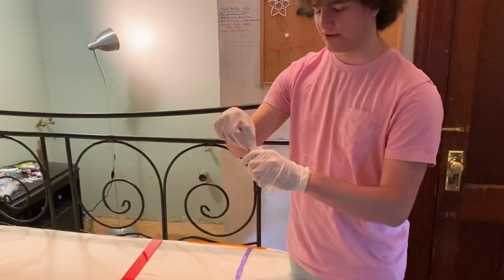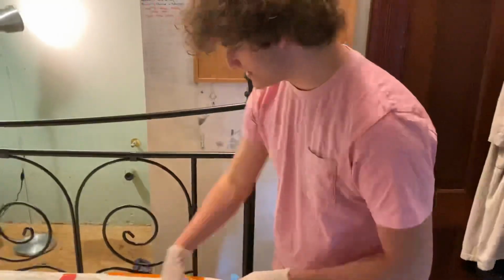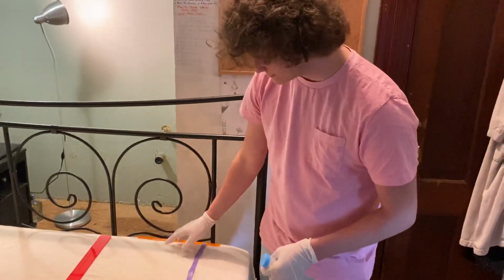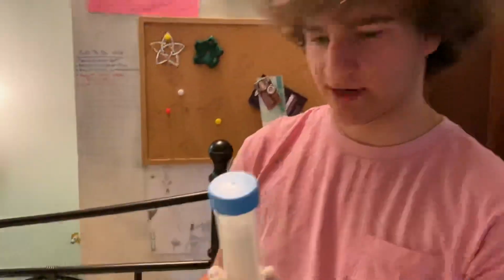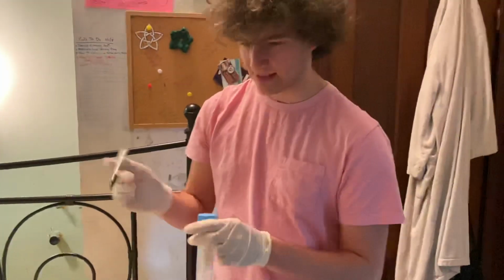My mom's so smart. So you're putting that, want to tell them what you just did? So I did north-south in an S shape, pressing firmly. Then I did east-west in an S shape, pressing firmly. Then I did the perimeter, and then I folded it, and I was folding it progressively each time smaller. And then I put it in a new centrifuge tube, and then I'm labeling that number 2.